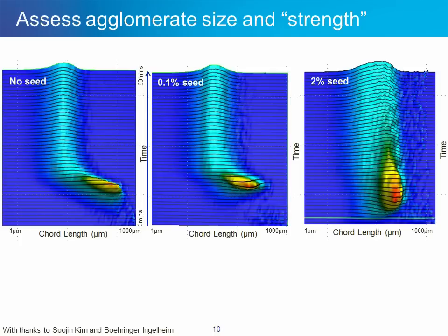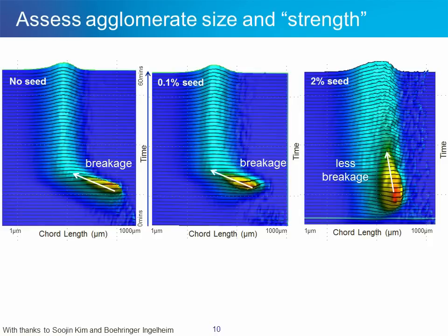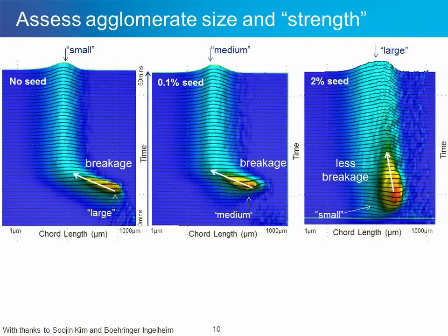Next we can look at the three crystallization processes in a slightly different data representation, looking in three dimensions. We're using a waterfall plot to study our chord length distributions measured by ParticleTrack and how they evolve over time. The heat map indicates particle counts in different size ranges, progressing vertically over time. For the unseeded crystallization process, we get nucleation followed by breakage. The same occurs for the seeded processes, but there's less breakage when we use 2% seed. Also, the unseeded process starts with quite large particles initially, the 0.1% seed starts smaller, and the 2% seed starts even smaller than that. However, the endpoint for each is reversed: the unseeded process ends with small particles, while the 2% seed ends with the largest crystals of all three experiments.